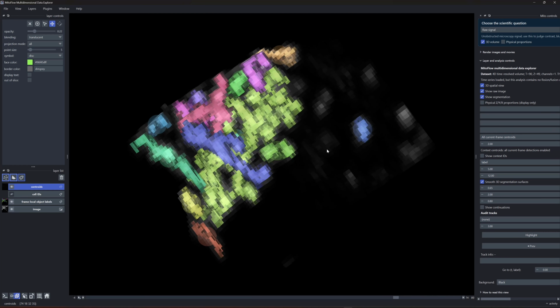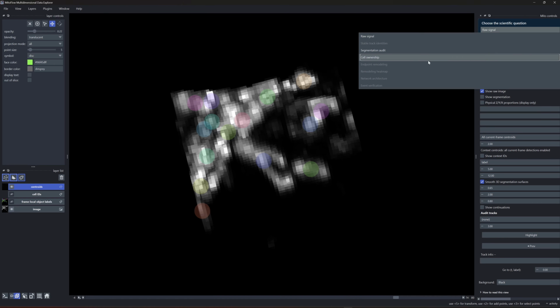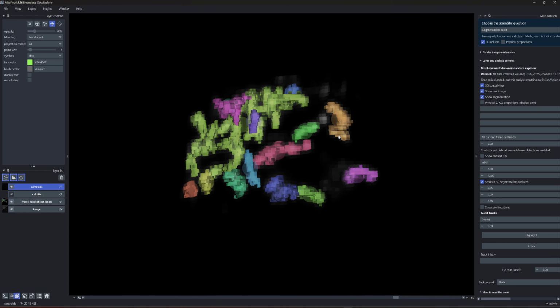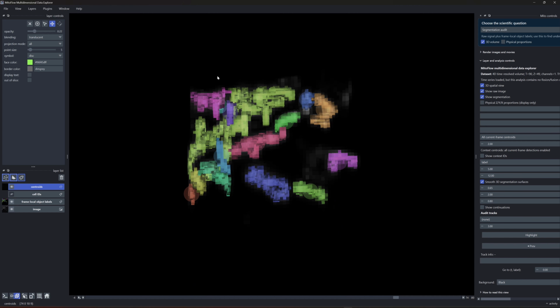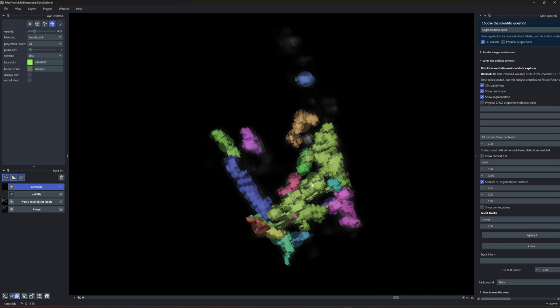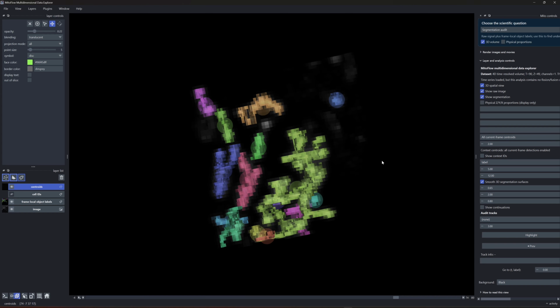But somehow doing that sort of analysis becomes extremely challenging and can end up taking 5 to 6 different programs and then 2 or 3 different plugins in ImageJ just to achieve some sort of a spreadsheet that contains the metrics that one might be interested in. And then, not to mention, after you're done with the programs, you still have the spreadsheets, which also need another set of spreadsheets to finally get to some sort of an outcome that is understandable by a human reader. So, long story short, somewhere in the middle of all of that workflow, you stop being a scientist, you start being a file formatter.